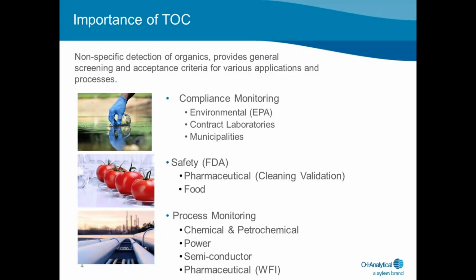Total organic carbon is often used as a non-specific indicator of water quality. In the natural processes of our environment and the man-made processes of industry, the ubiquitous nature of carbon provides a screening tool to determine the status of water quality. TOC systems can determine contamination from naturally occurring compounds, man-made compounds, viruses, bacteria, or biological growth. TOC determination provides quick and easy indication of organic contamination.